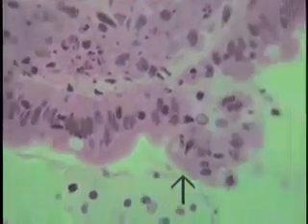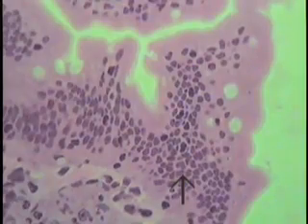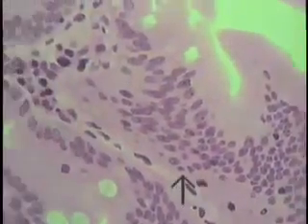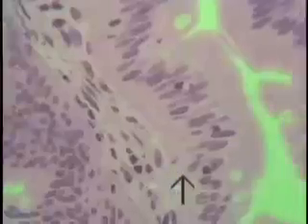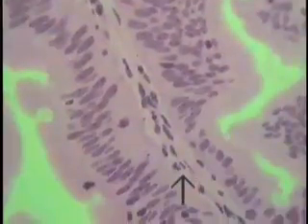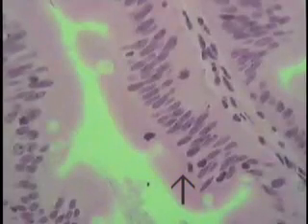Now, if one moves away from this area, you can see due to the folding, the region becomes quite confused, and that is because of the folding in the irregular contour of this intestinal epithelium. So one will have to look for a vertical straight cut through the surface, the surface villi, these finger-like extensions, to look for a simple columnar epithelium. If you move the field along, one will eventually encounter such an area.